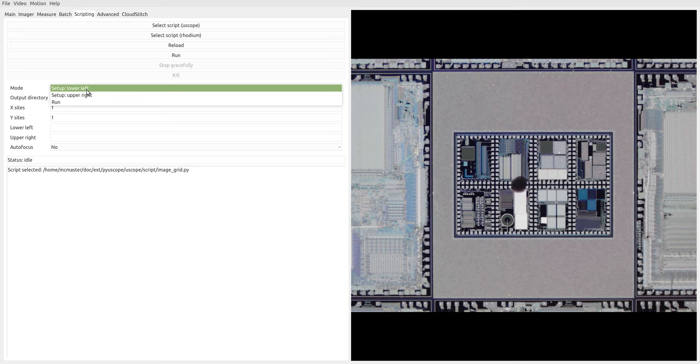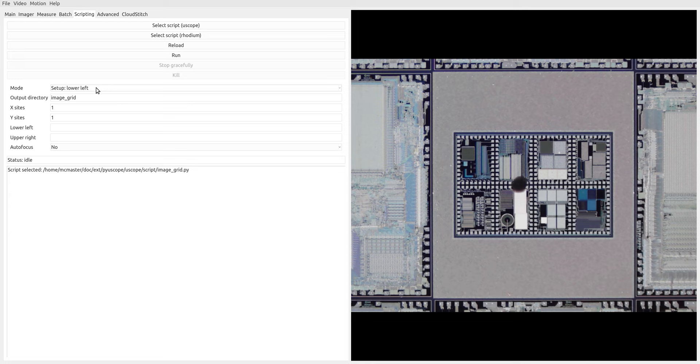The first two are to set up the lower left and upper right coordinates of our region of interest to define the area that we want to image. So let's start by selecting lower left, and we're at the lower left site that we want to image. So let's hit run, and we've inputted the lower left coordinates into the software here.